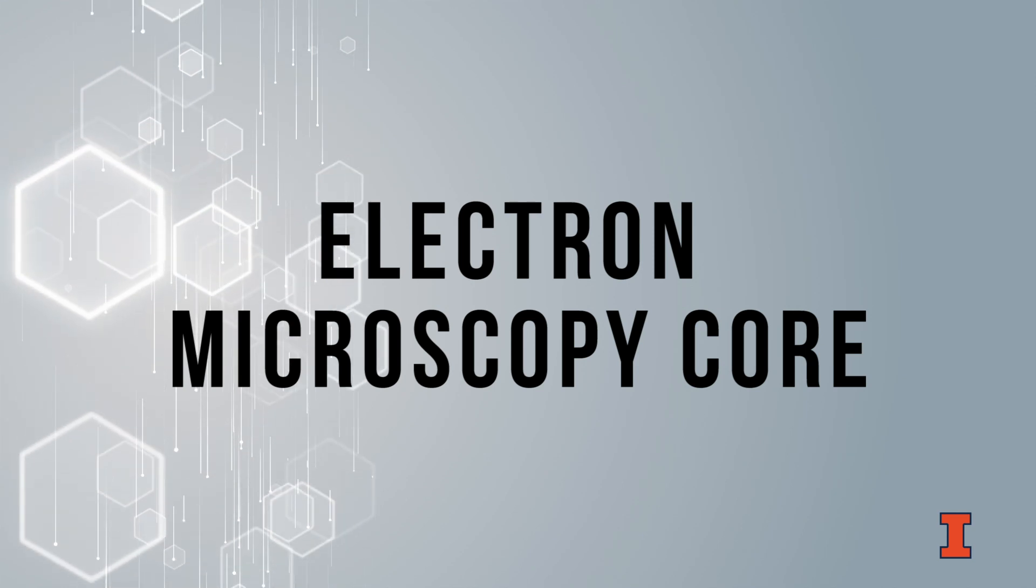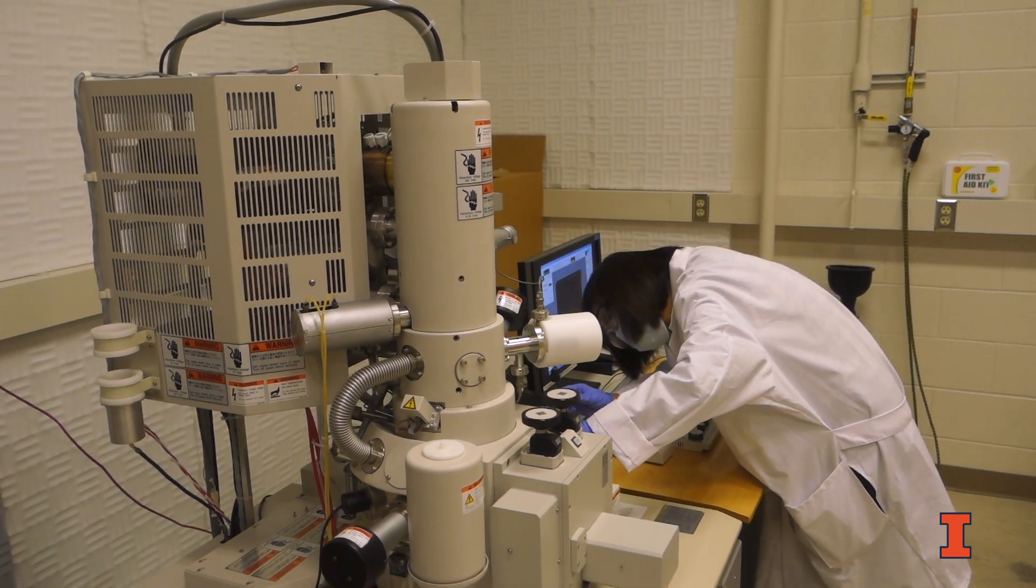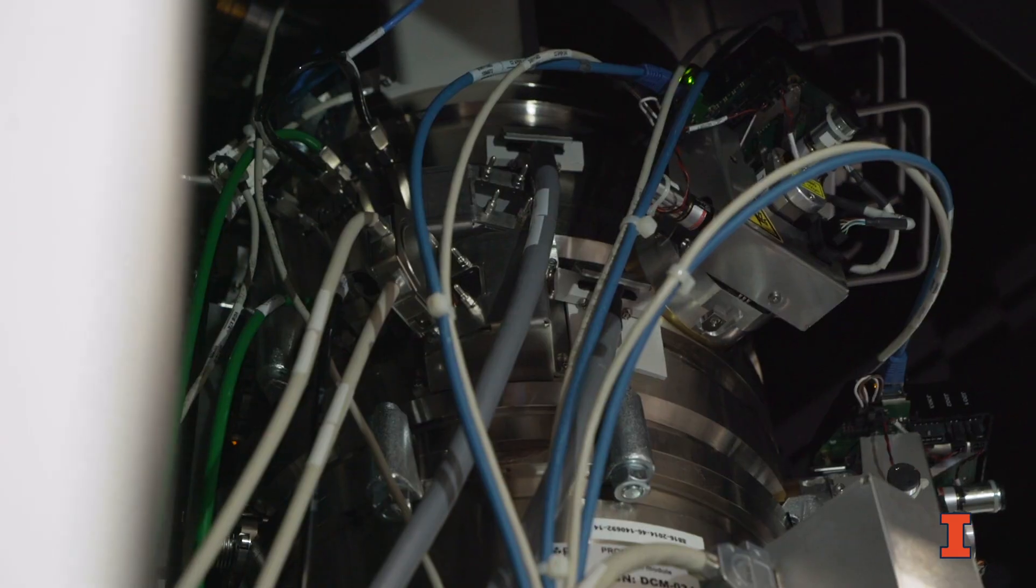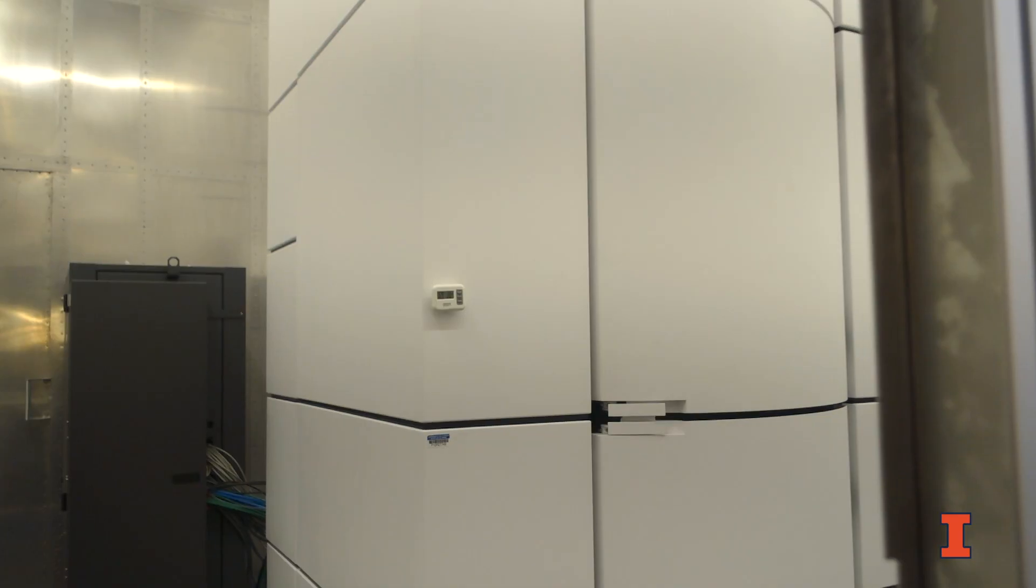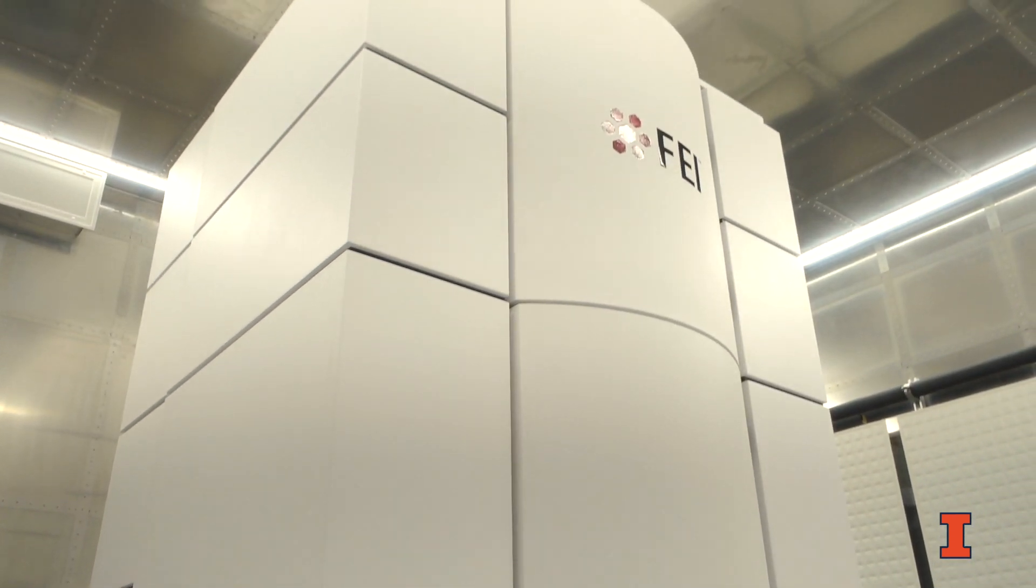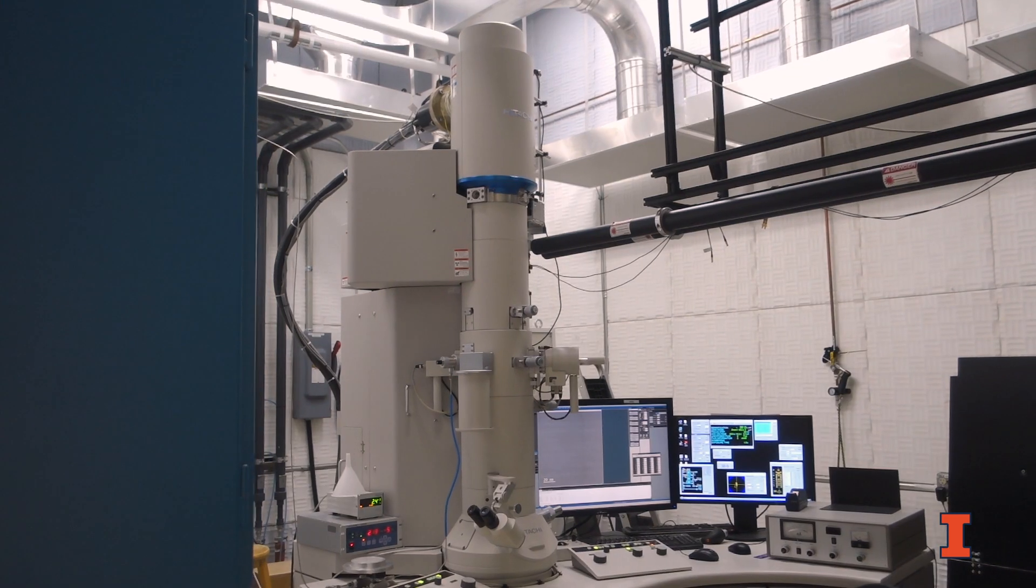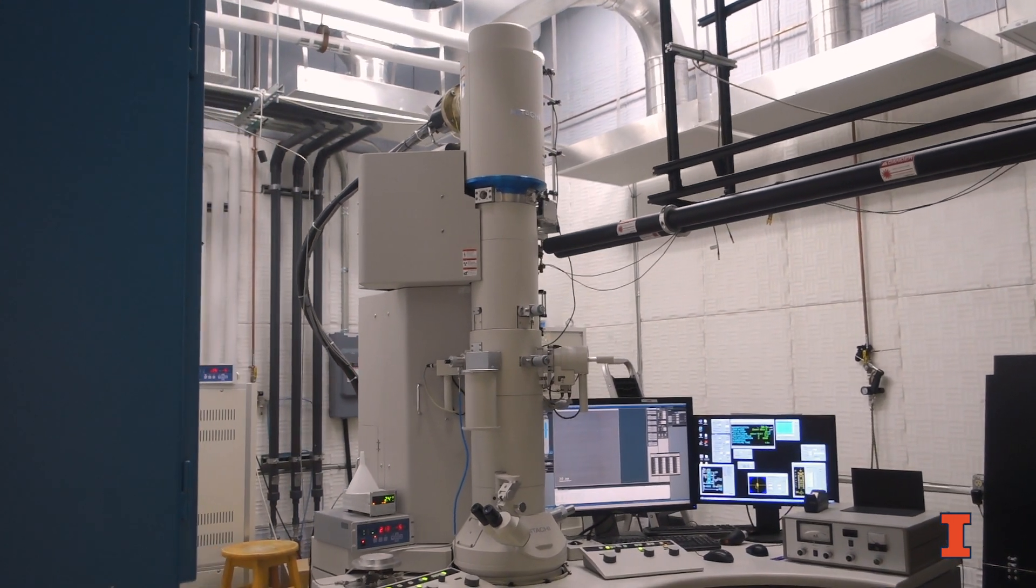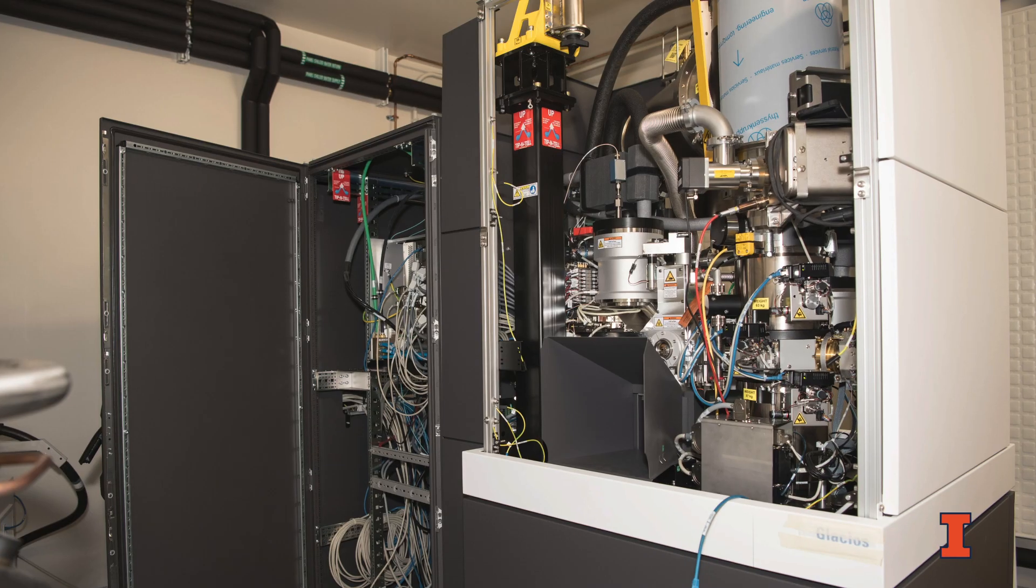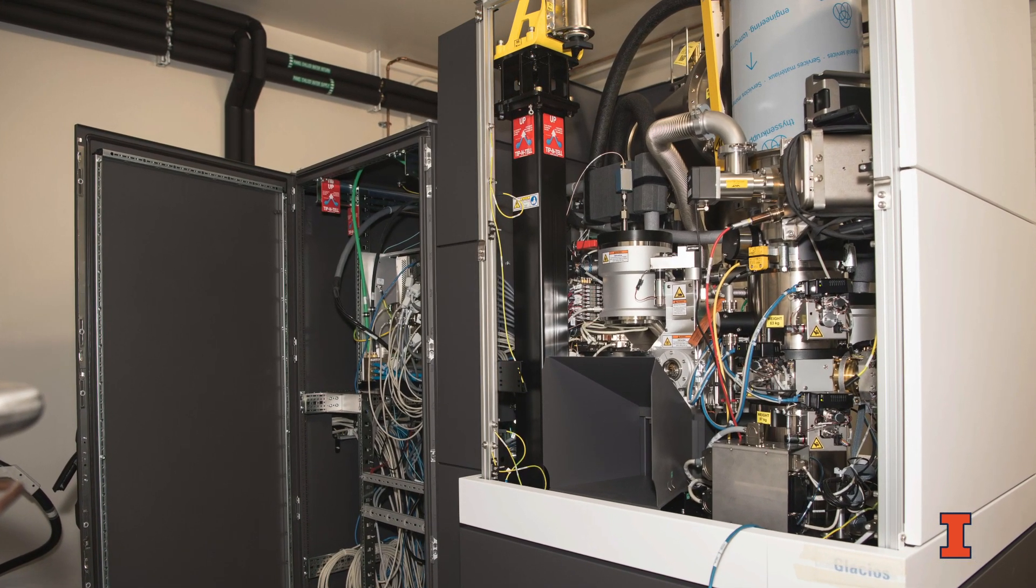The electron microscopy core provides a full suite of tools for sample preparation and microstructural analysis of materials at sub-nanometer scale. The core offers six transmission electron microscopes with diverse capabilities, including the Themis-Z analytical high-resolution STEM with energy-dispersive spectroscopy and electron energy loss spectroscopy. The Hitachi 9500 with environmental capabilities for dynamic studies, including wet, gaseous environments, and the new Glacios cryo-TEM with direct electron detection for structural biological analysis.